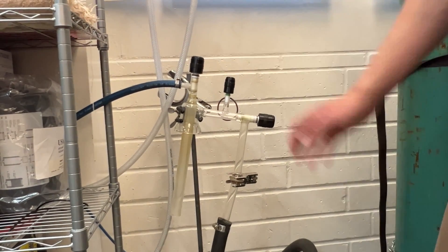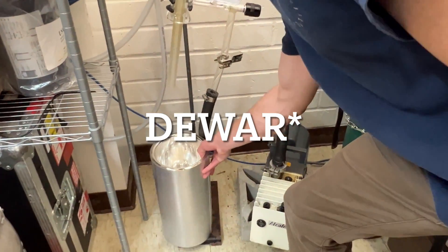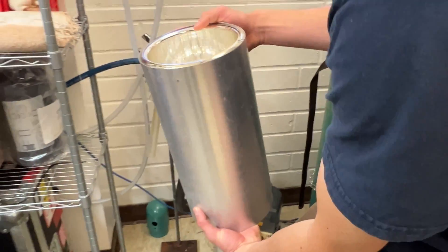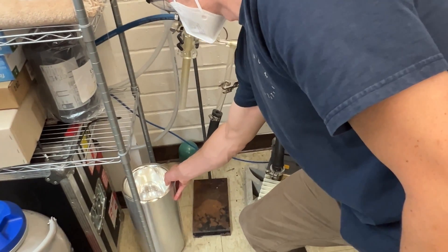They are righty-tighty lefty-loosey valve knobs as well. Next, let's go ahead and look at our flask. This flask is borosilicate glass and the base is an aluminum base — it's essentially a big thermal flask like a Stanley.